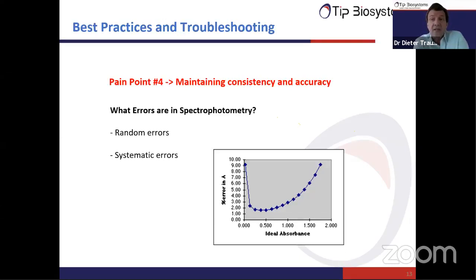And I think now you can understand why it's like this, because I showed you before the logarithmic relationship of the absorbance. Every absorbance step from 1 to 2 means there is only 10 times less of the light going through. This is why at a very high absorbance, the error is relatively high.